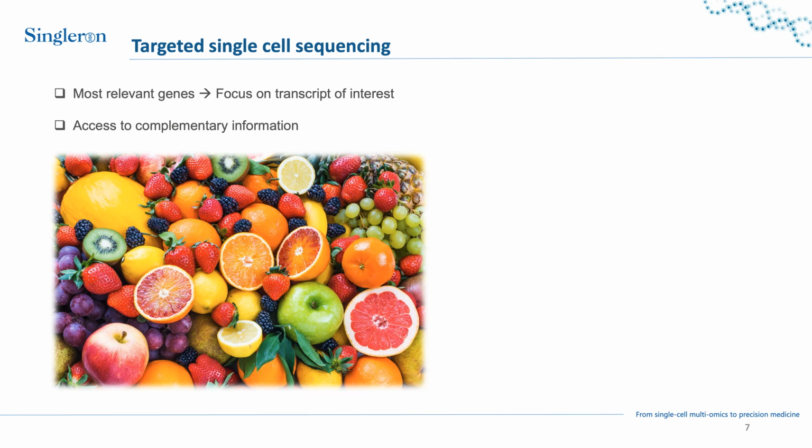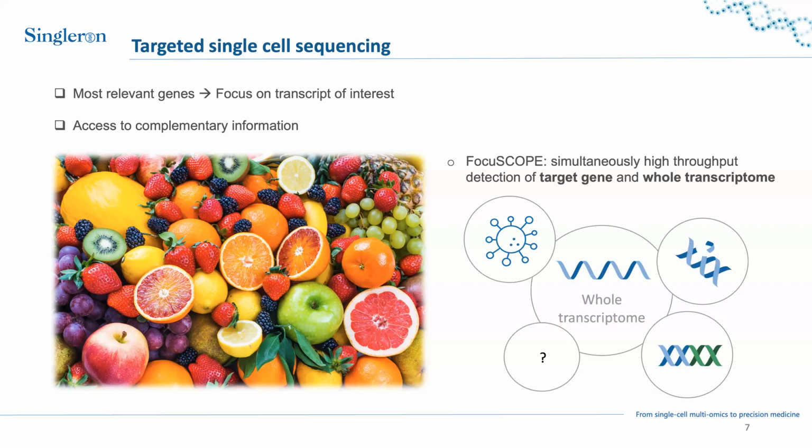To analyze this, you would need an additional layer, and in the case of single-cell sequencing, this could be realized by the FocuSCOPE.